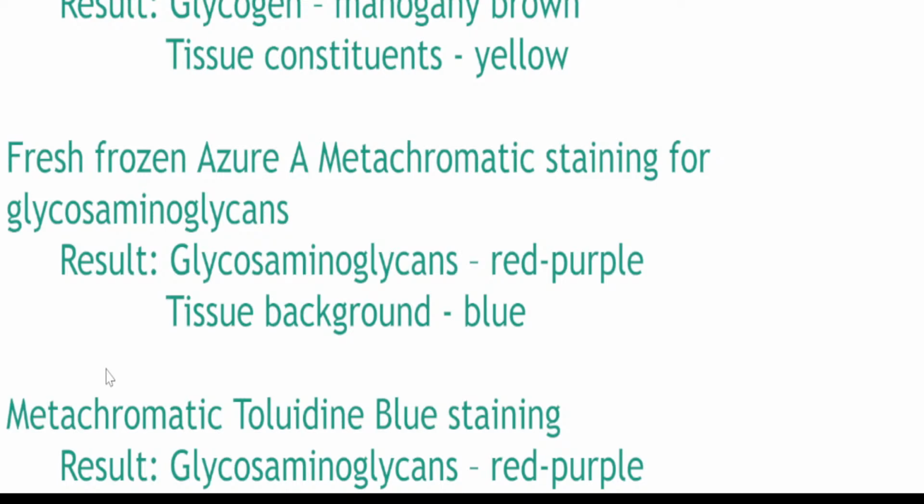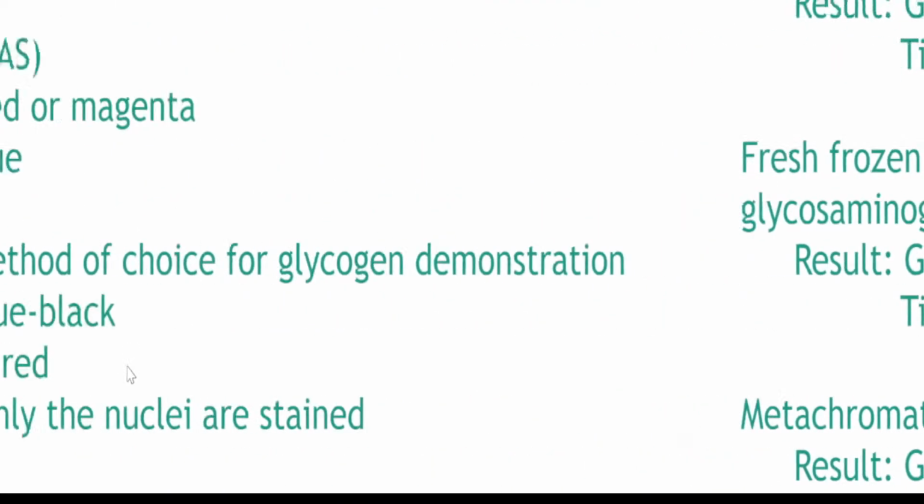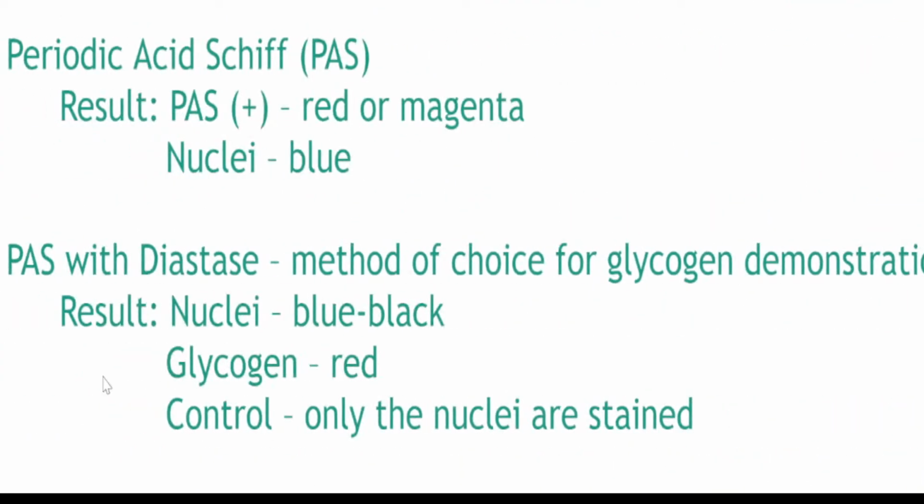Okay, fresh frozen azure A, metachromatic staining. So again, I want you guys to focus on this. This is mostly memory work. I know I don't want you guys to memorize, but that is the reality of clinical, sorry, histopathology. You have to memorize certain things.